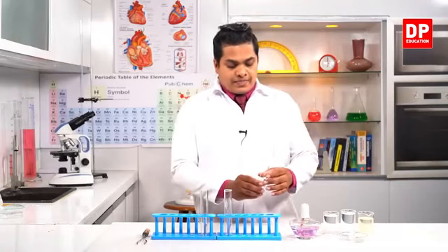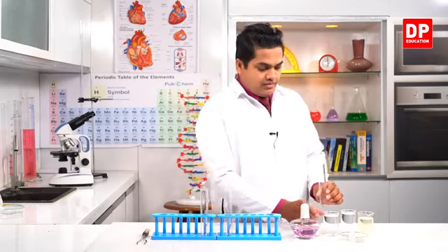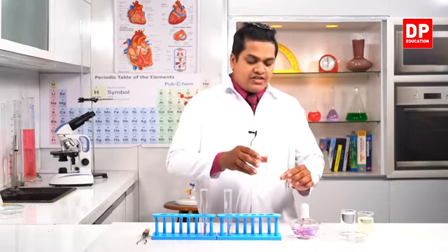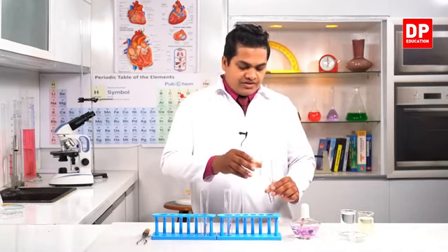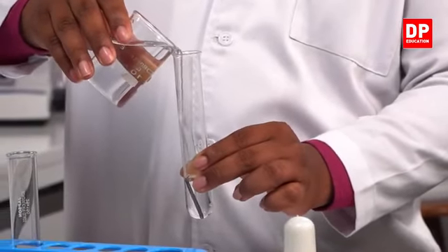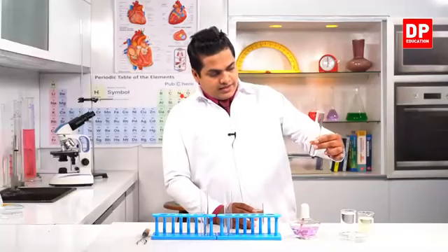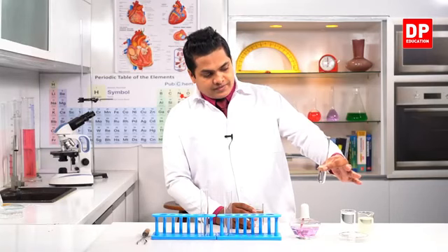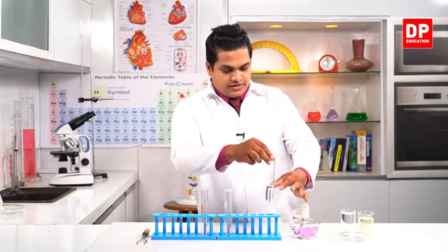Then I'm going to take some water and add this cool water. This is normal cool tap water. I'm going to insert this normal cool water into 1 test tube so that the iron nail is covered entirely like this. Okay. So I'll place it in here. Number 1.